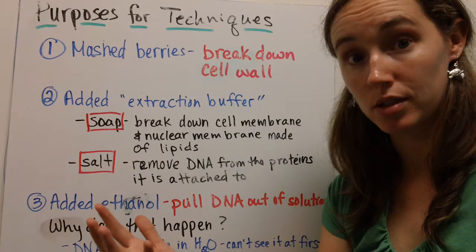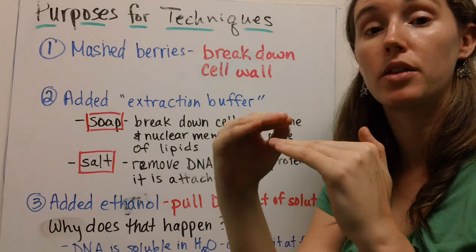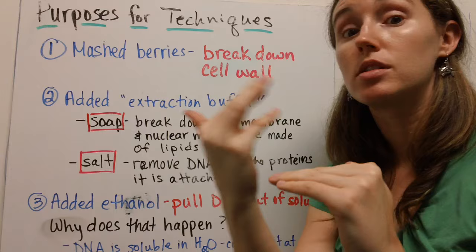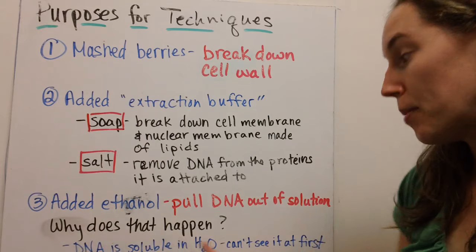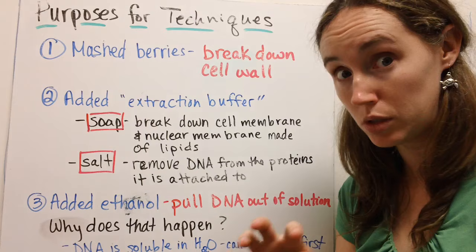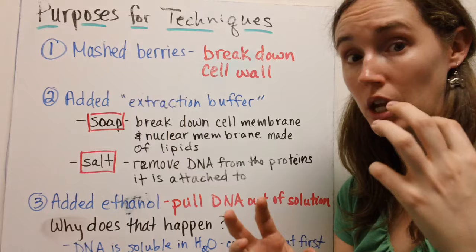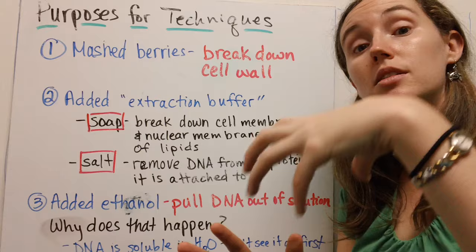Now, after we filtered that fluid, we added 5 milliliters of ethanol. And when we added the ethanol, the DNA rose up from the strawberry solution and was suspended in that ethanol layer. That happens because DNA is soluble in water, so that's why we can't see it in the strawberry solution. It's dissolved in water. But in ethanol, it's insoluble, so it can't be dissolved. It pulls away and separates and is its own special thing. So that's why when we add the ethanol, the DNA rises to the top and we're able to pull it out of that strawberry solution.